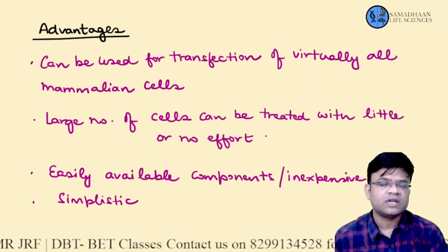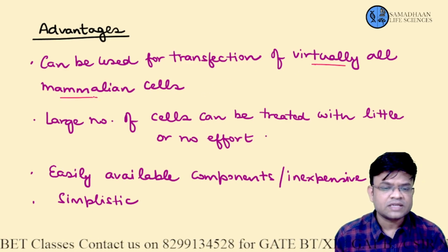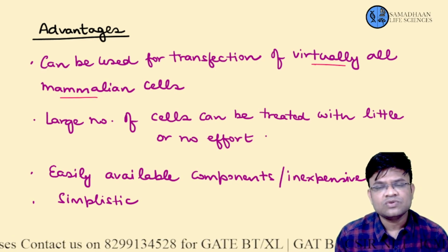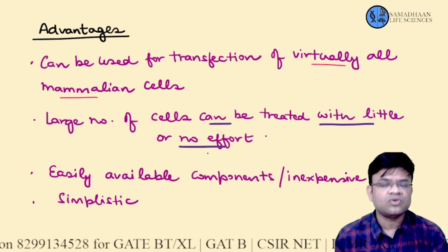Now let us talk about the various advantages of this method. It can be used for transfection of virtually all mammalian cells. Now I have already said that it is a very common method. It can be used for all the mammalian cells. Next, a large number of cells can be treated with little or no effort.